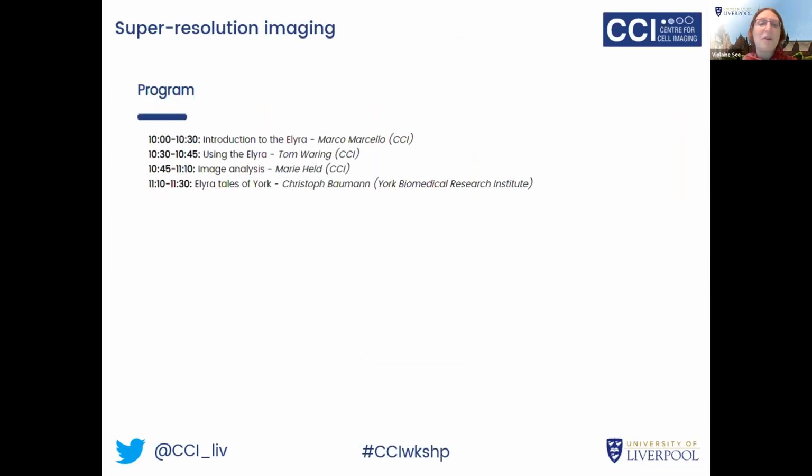In fact, it's written Christoph Baumann here, but we have also Grant Calder, who is here from York, and they had the Elyra installed just a few months ahead of us, and they got it from the same funding stream. So they have already had the opportunity to use it. They have a bit more experience, tiny bit more experience than us, but they already used it. They already have users. They trained 3 users already. It's very great that we can have some contact with them and maybe exchange some tips on how to do the training, which happens remotely. All the training the CCI staff had so far was all remote, but it has worked. So yeah, that's the program for this morning.